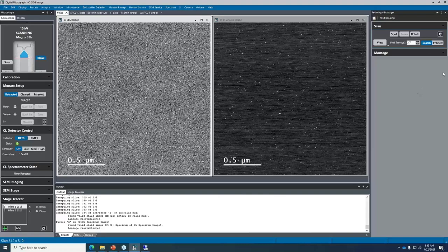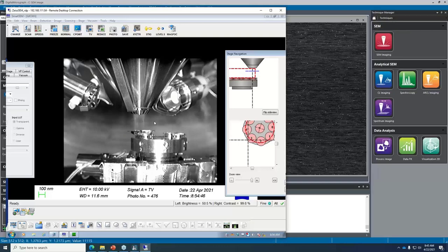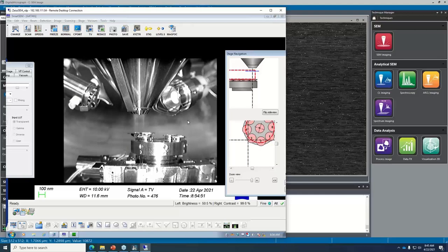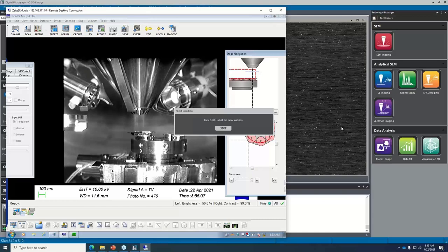Over on the right is the technique panel — you have a technique manager with all the different techniques that you can quickly switch to. Right now, looking in the microscope, the CL mirror is not inserted. I'll lower the specimen down randomly so we're at an unknown height, and then I'll insert the CL collection mirror so we can all observe that — the mirror is going to move in from the left side of the screen, just beneath the pole piece.